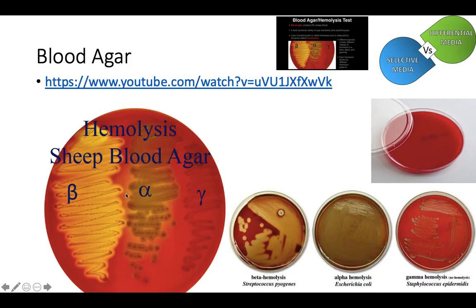It was a gram-positive coccus, which means it's probably some sort of strep. And this is how you tell apart the different species of strep, the differential aspect. So just because it grows doesn't mean it's a strep, but if you've done your job correctly, you will probably only have streps left. And this is where the differential aspect comes into play.